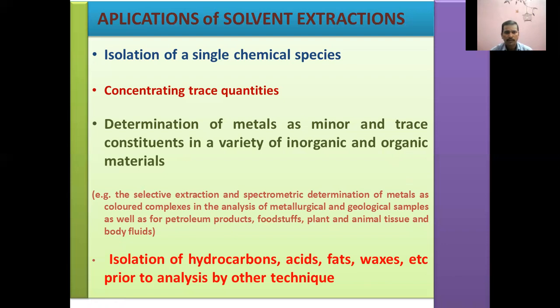And more particularly, metals are going to be extracted, and the extracted metal will be subjected to react with certain reagents, because we know some metals will react with the reagent and produce colored systems, colored complexes or colored products. The absorption of these colored products or colored complexes is proportional to the concentration of the metal.